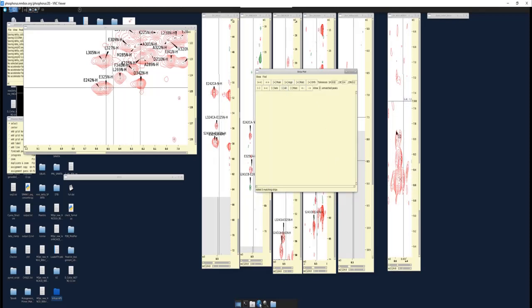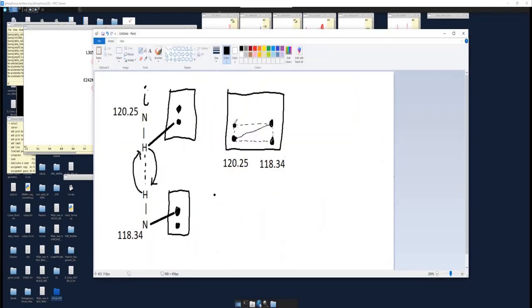And that is searching the NOESY strip plot itself. If you recall, I brought up that within each strip, so this is one strip and this is another strip, you're going to have connections. One amide is going to be able to see the other and vice versa. And so you can actually search these in a strip plot and say what strip here is able to see this strip here as well, which ones are basically connected.